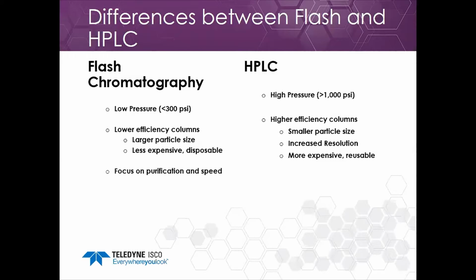Flash chromatography is really a focus on purification and speed. We want to try and get the compound as pure as possible, as fast as possible. And so we're always balancing those two objectives when we're choosing a flash chromatography method.